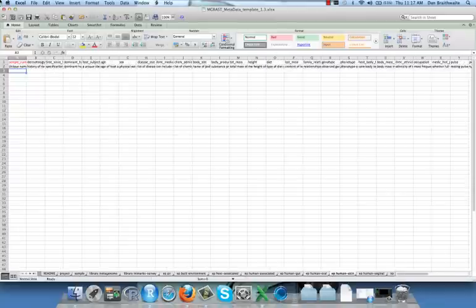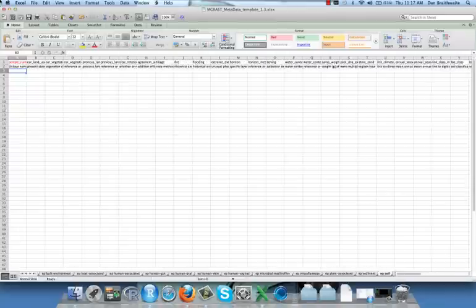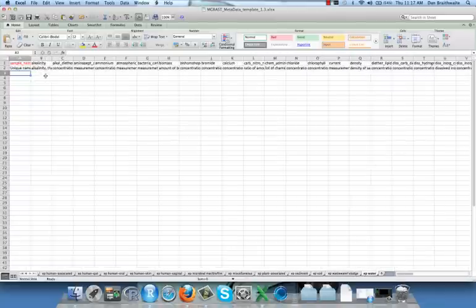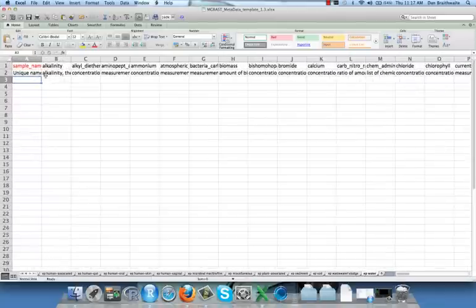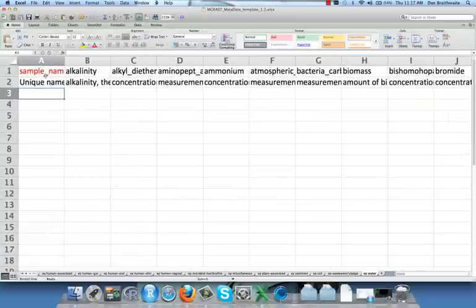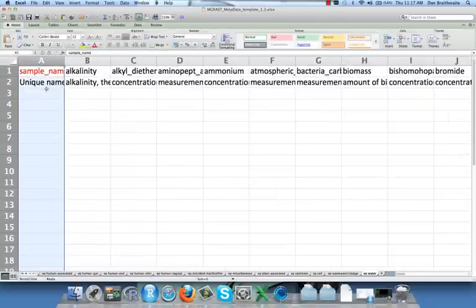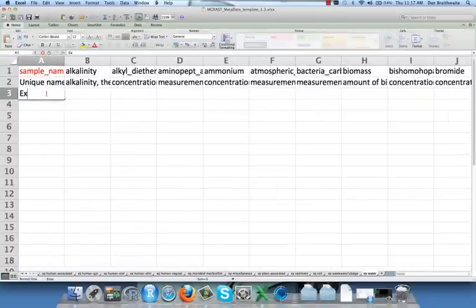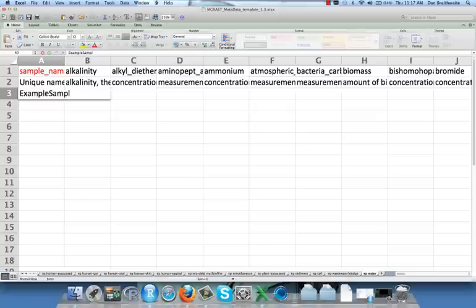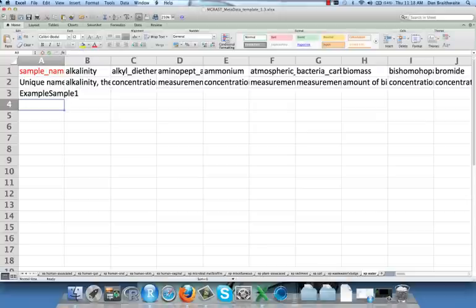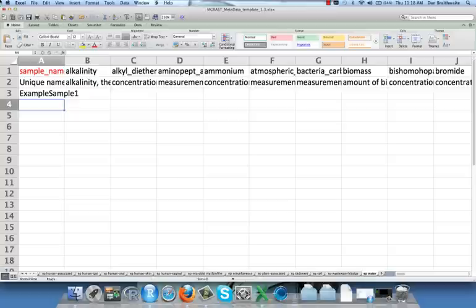Finally, locate the sheet or sheets for the environmental package or packages previously chosen. On each relevant EP sheet, enter the exact sample name or names, one per row, that you specified before and that belong with that environmental package. In this demonstration, we have only one sample, and it uses the environmental package water, which happens to be the last sheet. We are entering minimal information here, but we urge you to complete as many fields as possible.